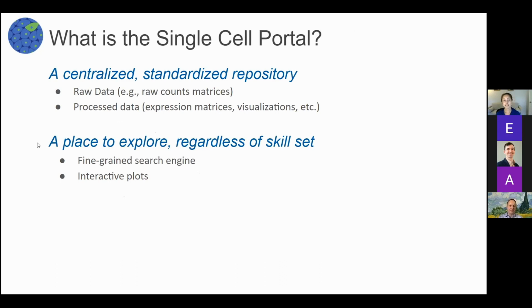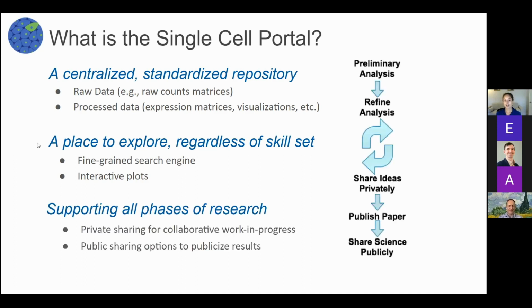In addition, it's designed to be a place where you can explore these data without requiring any computational experience whatsoever. Instead, we have a suite of dynamic, interactable visualizations that you can use to try to understand the patterns in these multidimensional data. And finally, SCP is designed to support all phases of the research lifecycle, from when you've just collected data and are sharing it with collaborators to try to suss out what story those data tell, to once you've figured out what that story is and you want to share it with the broader research community.